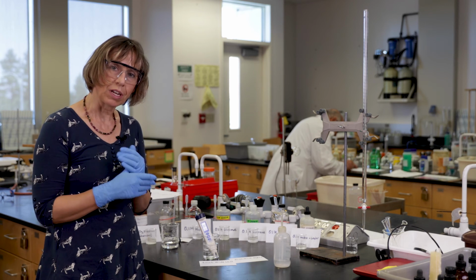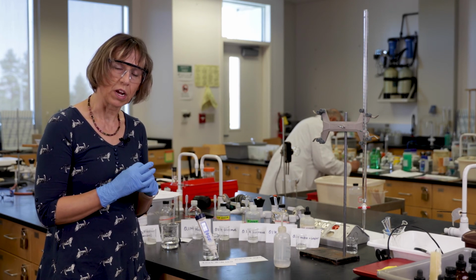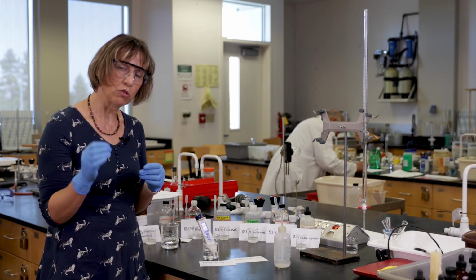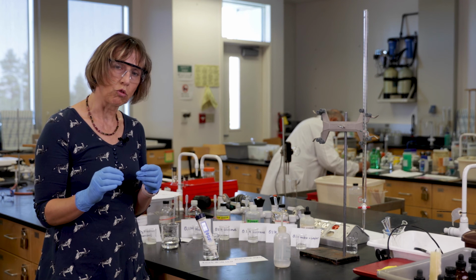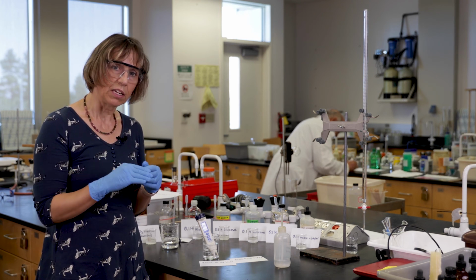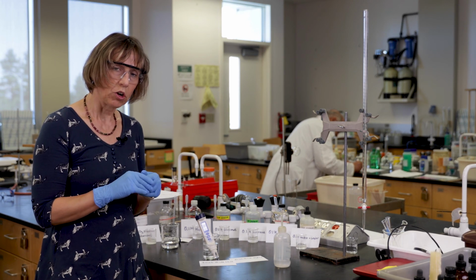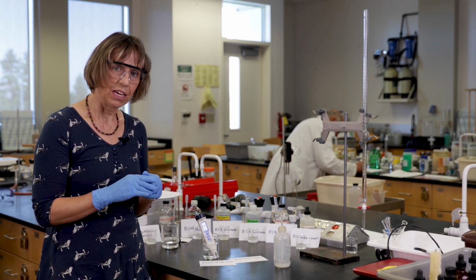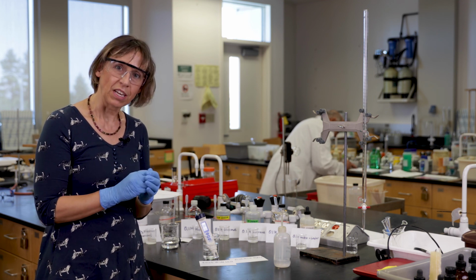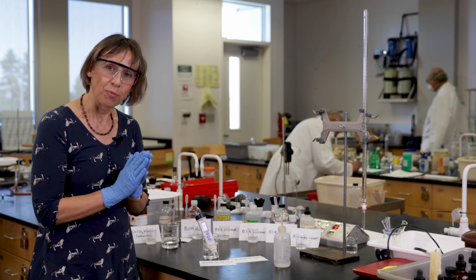You want to calculate the molarities and the moles of sodium chloride. So we started with 20 milliliters of 0.1 molar sodium chloride, and we added 8 times 10 milliliters of DI water and measured the conductivity at each addition. I hope you found that interesting. It's going to be a nice graph, hopefully, when you graph those data. Have fun.